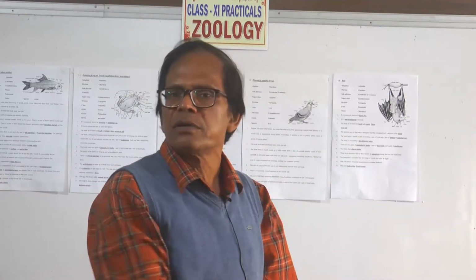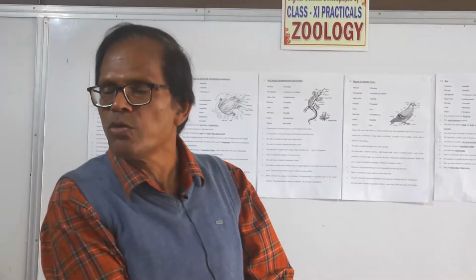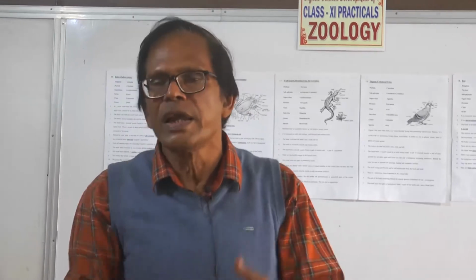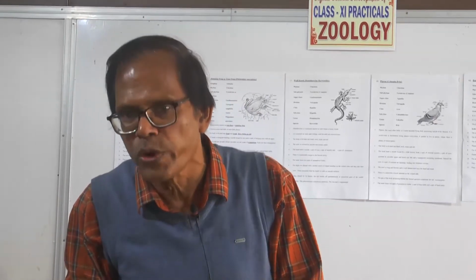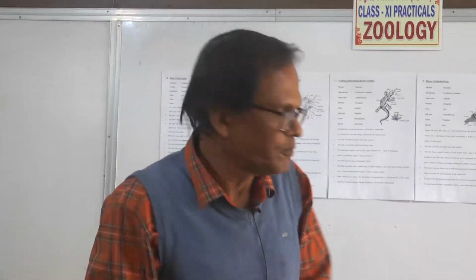This is about a white rat. These are burrowing. A little while ago, I was telling you about the burrowing habit. A technical term is used for the burrowing habit, that is fossorial. They can dig burrows and live inside the burrow safely.